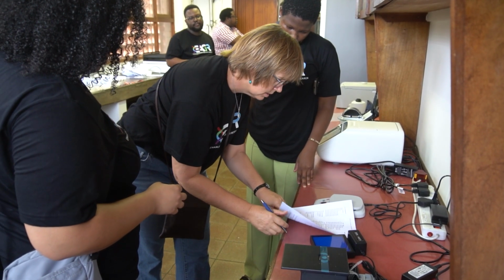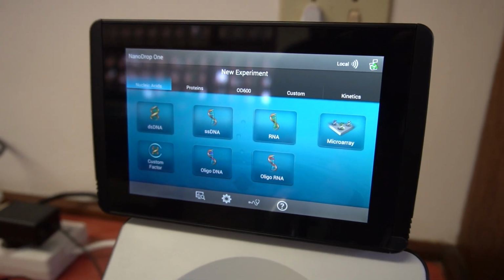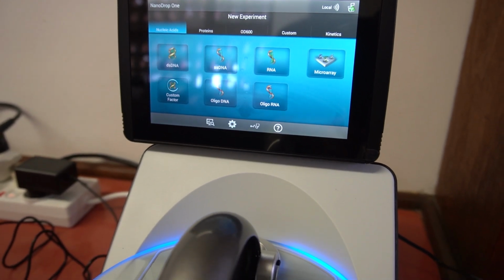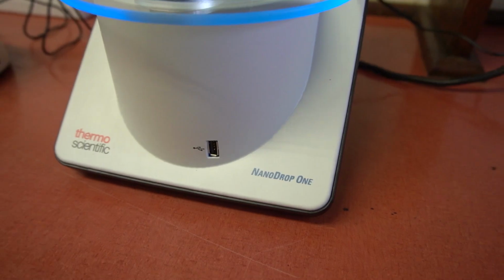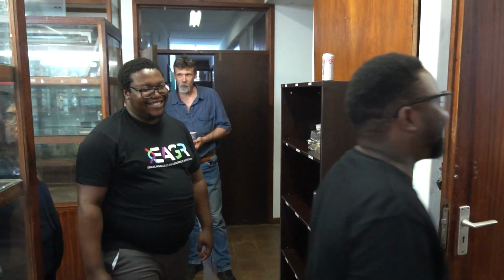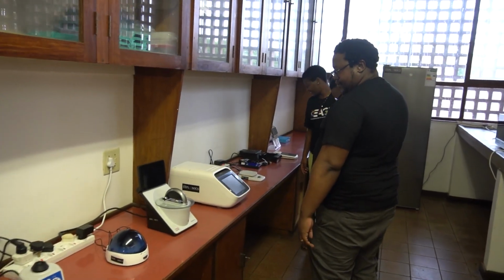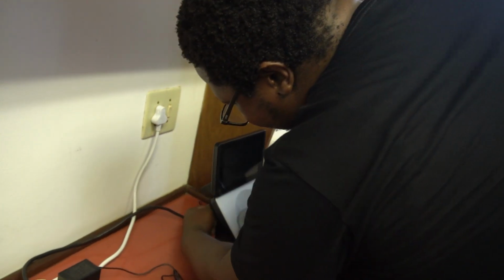When considering that DNA is one of the emerging fields, we have access to this lab and we'll be able to do different research and use different equipment, maybe see which one works better and which one gives better results. A lab such as this enables me to pursue the objectives of my study, so I'm able to pursue a PhD. There's easy access, it's here at the university, we don't need to plan ahead and travel to Grahamstown every time we need to use it.